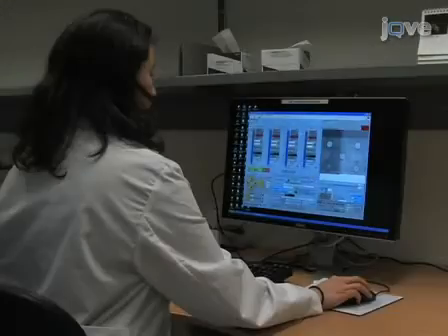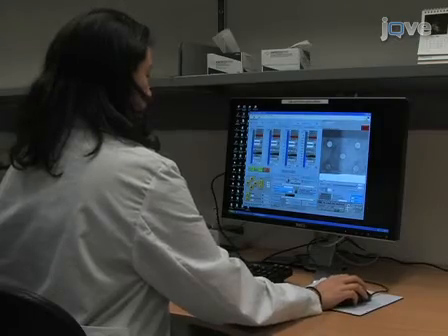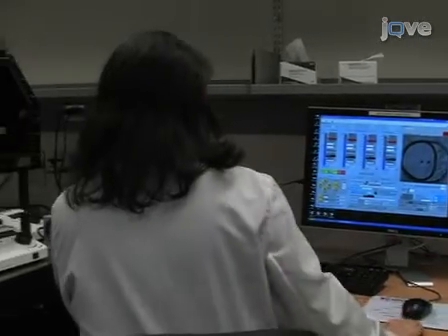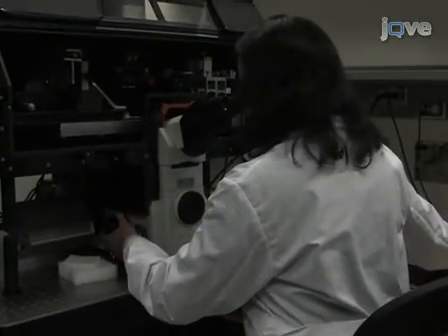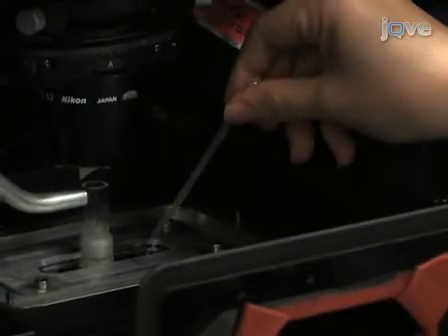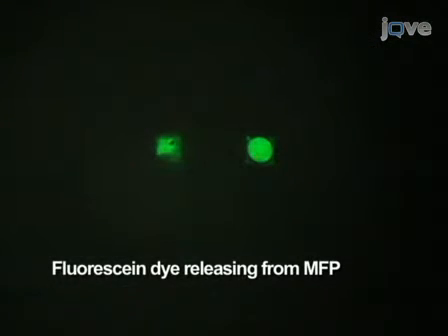During operation of the MFP, dispensing is controlled by LabVIEW software. Device operation is visualized by eye and with a CCD camera. Before starting proper aspiration, inject some liquid to make sure the aspiration syringe is oriented properly and that there are no bubbles.